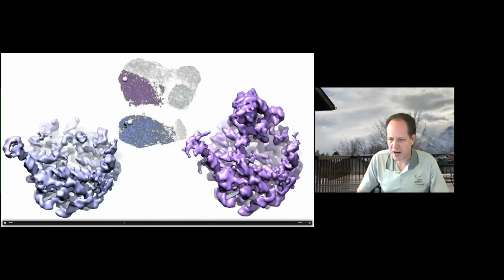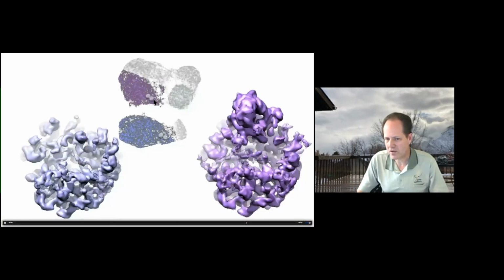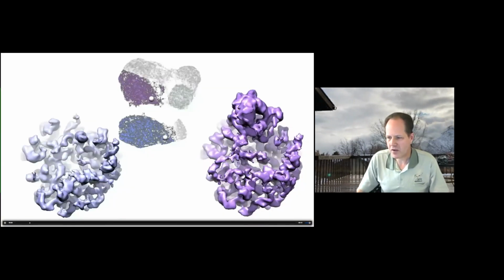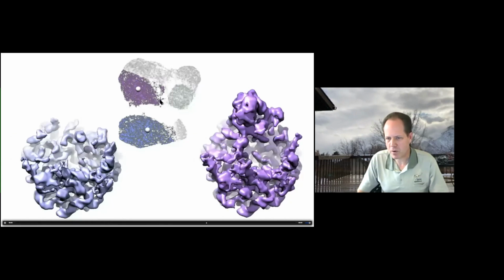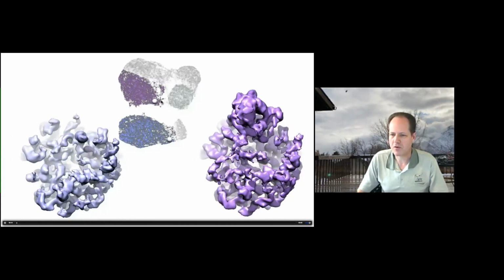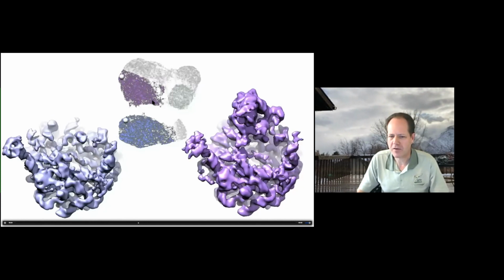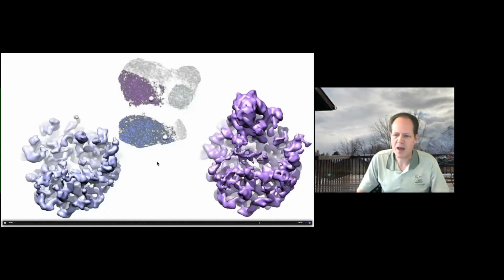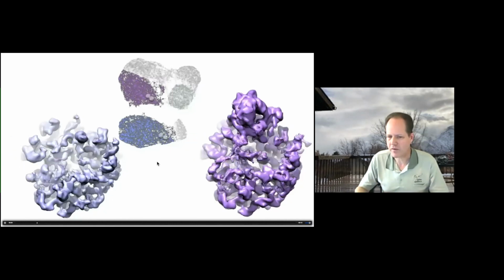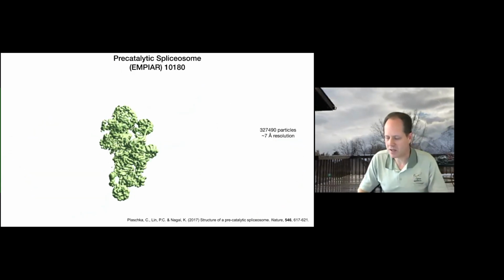And this is an interesting effect: as we move across this space and across this space, we observe a similar sort of change. If you look here and if you look here, we observe a similar change as we move in a similar direction through this manifold space. Now, that's not required to happen, but it seems to happen fairly frequently when we've done this analysis on other problems. But anyway, this shows you how you can use this tool to explore the variability in your system. I've got one other example, which is continuous variability.